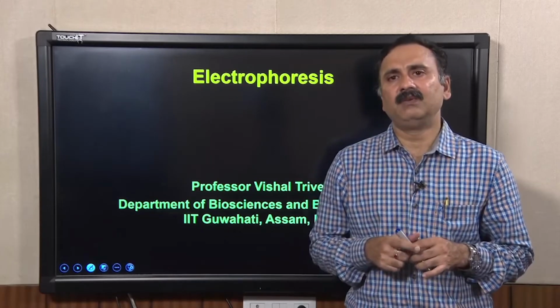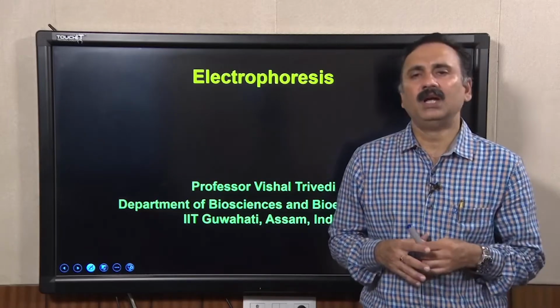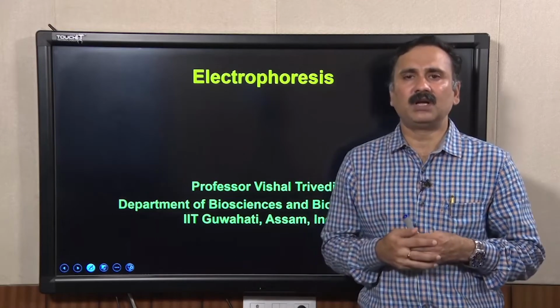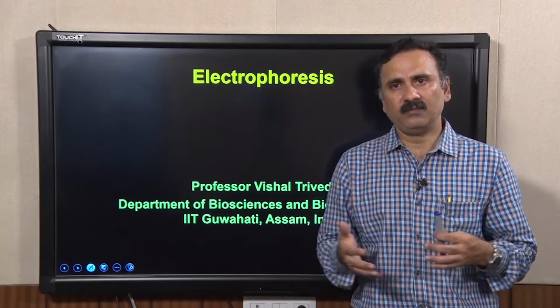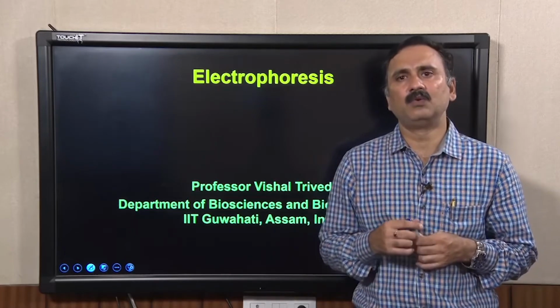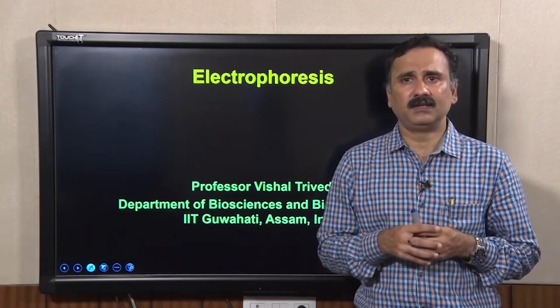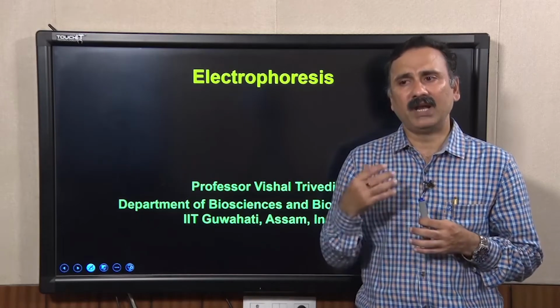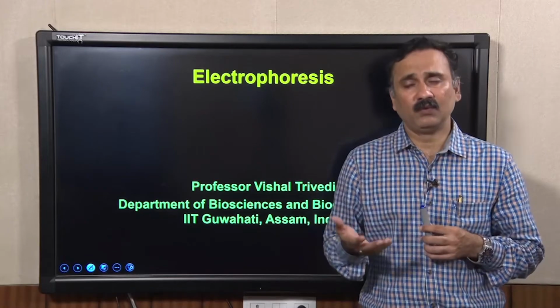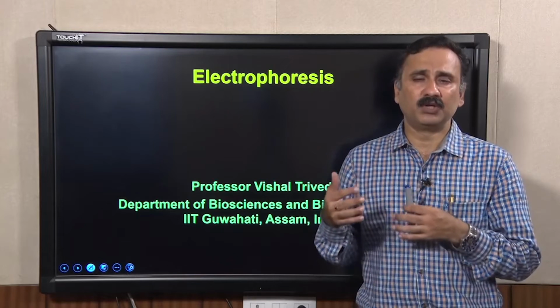And what we were discussing about the horizontal gel electrophoresis in our previous lecture. We have discussed the experimental conditions and how to perform the gel electrophoresis. We have also shown you small demo clips of how to do it in the lab. And I hope that these two things have explained horizontal gel electrophoresis in more detail, and you will be able to perform agarose gel electrophoresis in your own laboratory.